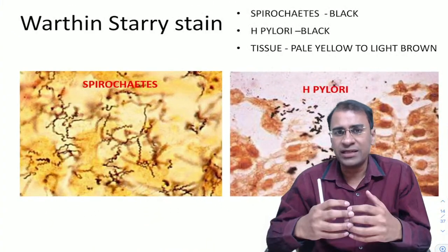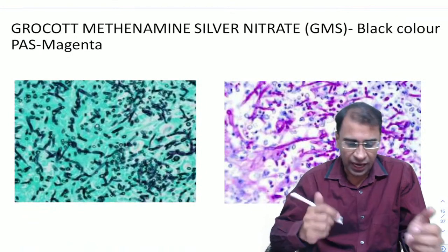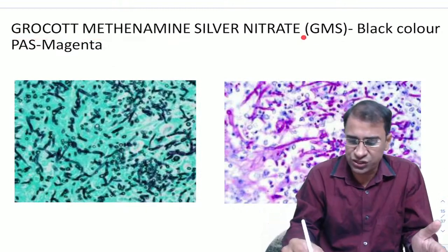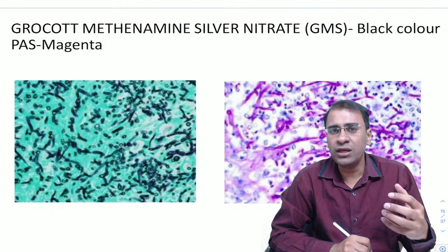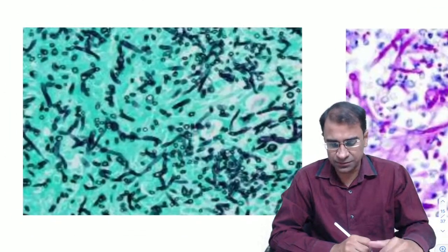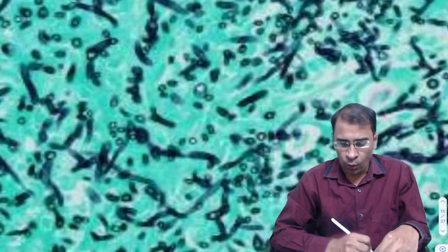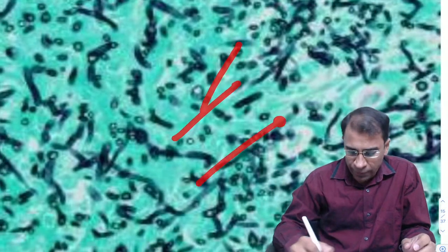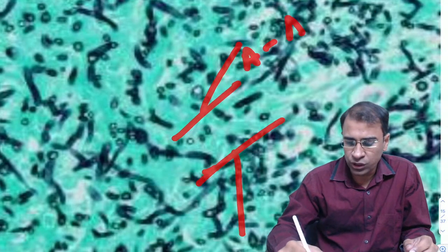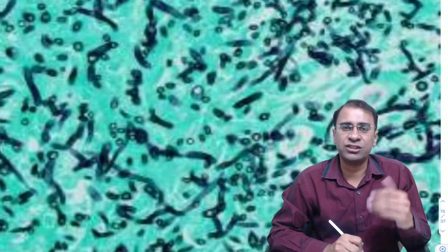But nowadays, there's one more thing that you should know, especially in fungi, and it is Gomori methenamine silver staining, called GMS stain. Now look at this. This is a fungus. Often fungi are diagnosed on the basis of the branching, whether it is acute branching or obtuse branching. Acute branching: A for acute, A for Aspergillus. And obtuse branching is usually Rhizopus or Mucor.